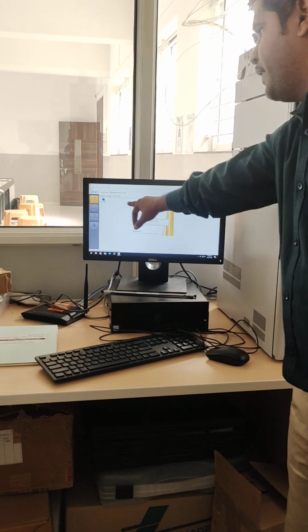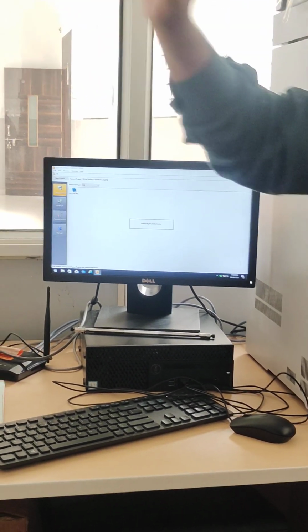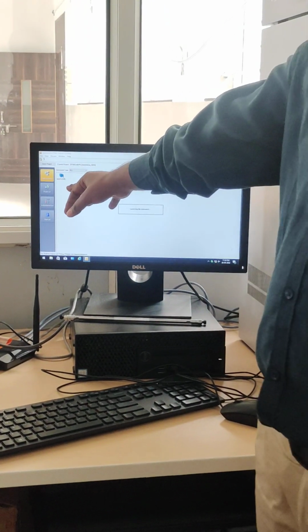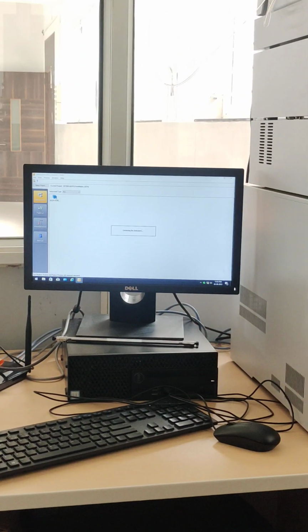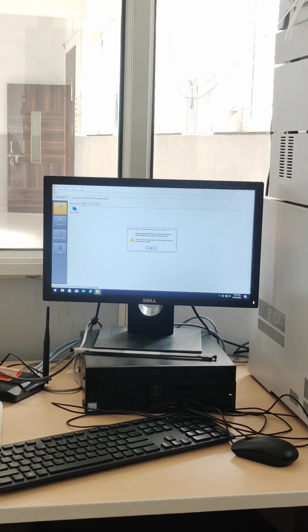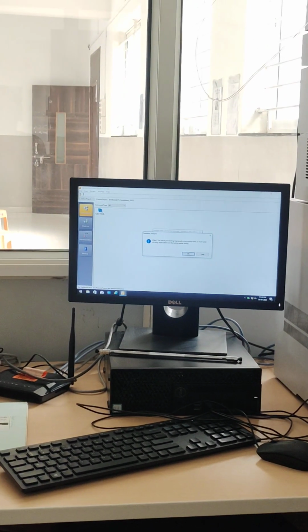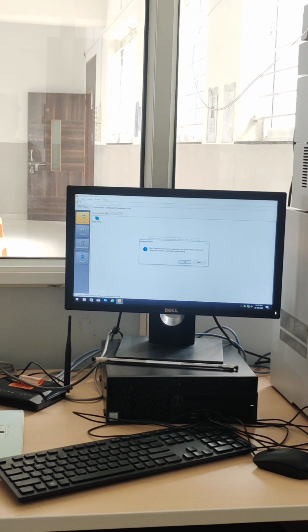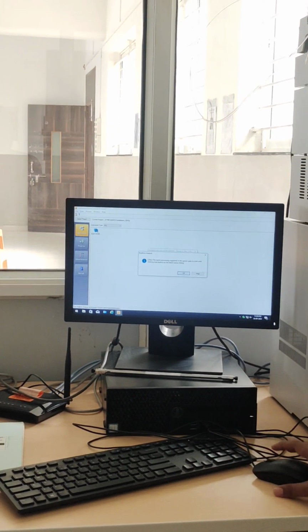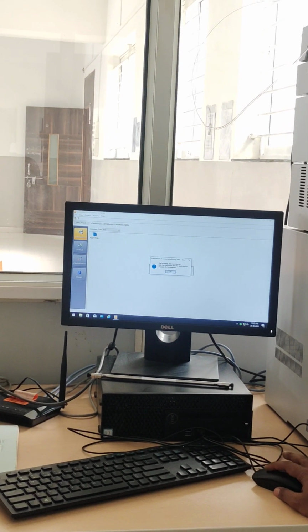In this software we can attach at least 20 HPLCs in total. Now we have only one HPLC with us, that's why I have clicked on that. The sound will be clicked. So automatically we'll get confirmation that the software is connected with the HPLC. In a UV, PC control will be available. Now again we click OK, OK, OK.